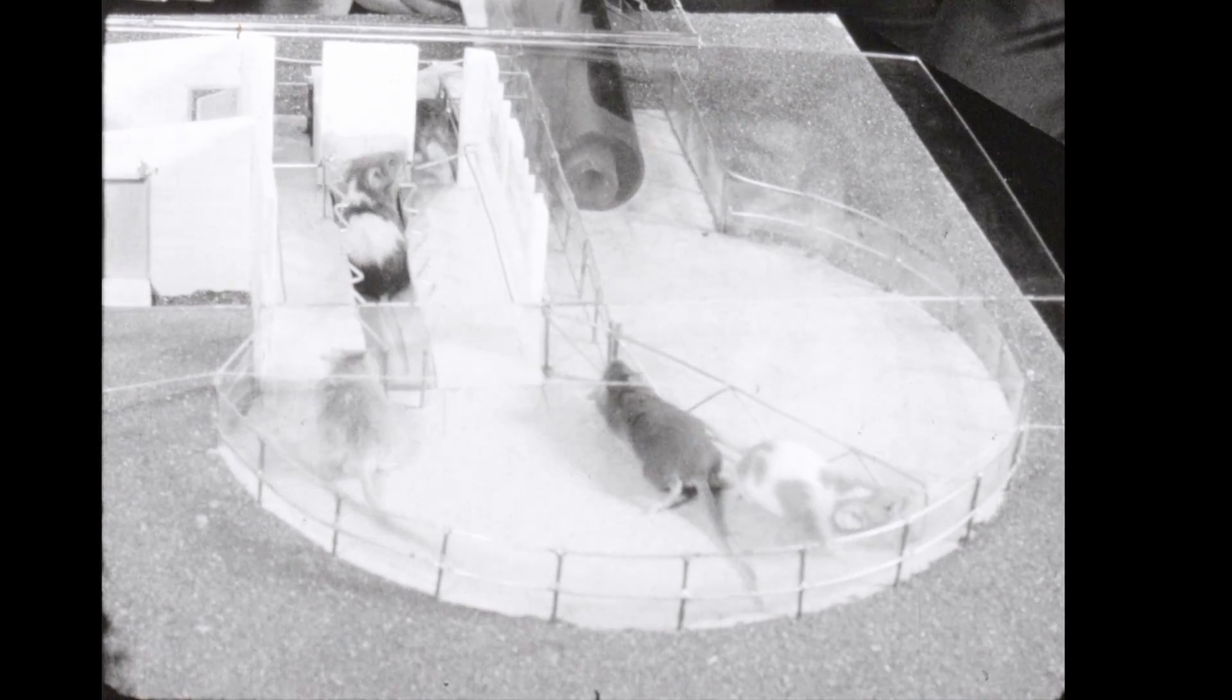Visitors to the recent open day were able to see mice being milked by miniature machines in the laboratory.